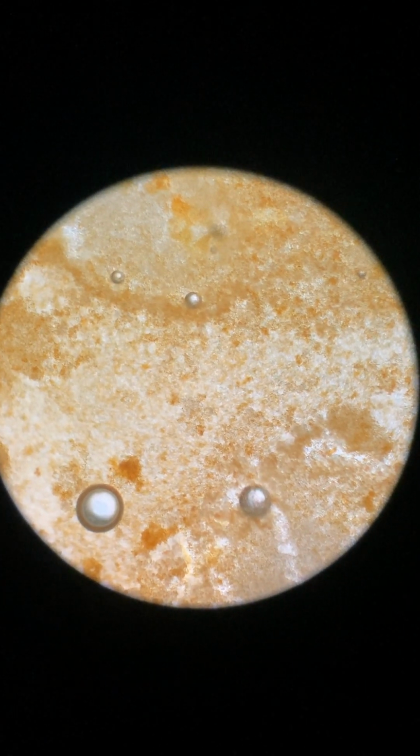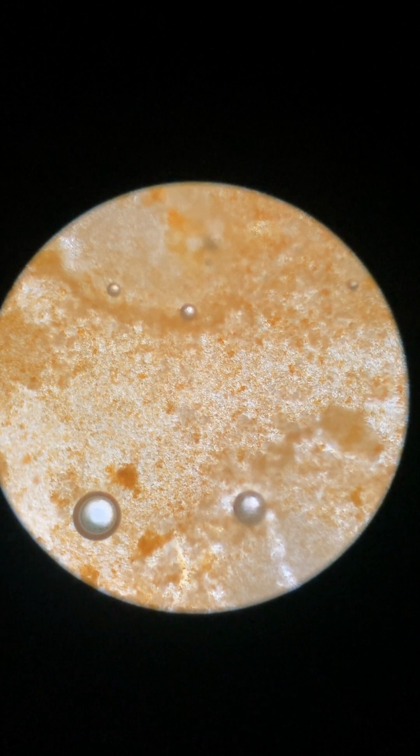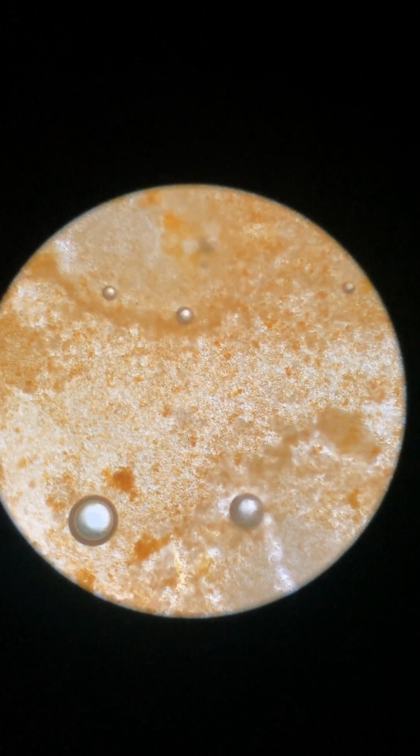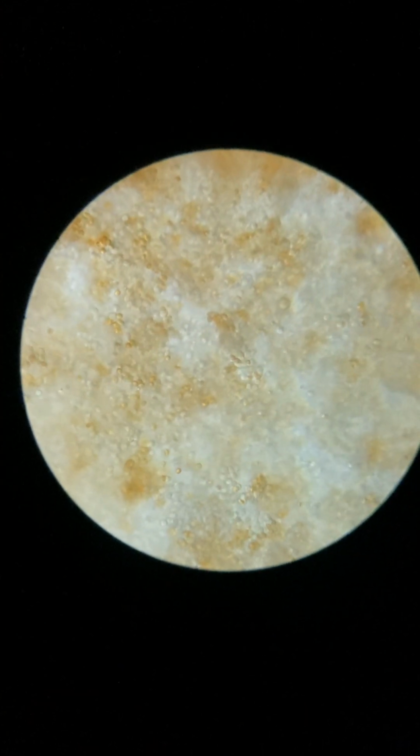Here's what I saw at medium power on my microscope. Those bigger bubbles, kind of at the bottom of the screen, are just air bubbles. And here's what I saw at high power. It's hard to tell on my screen, but at home, make sure you're looking for yeast cells that have another cell attached to them. This is an example of budding.